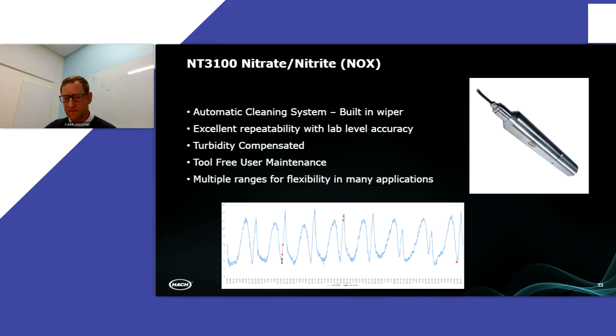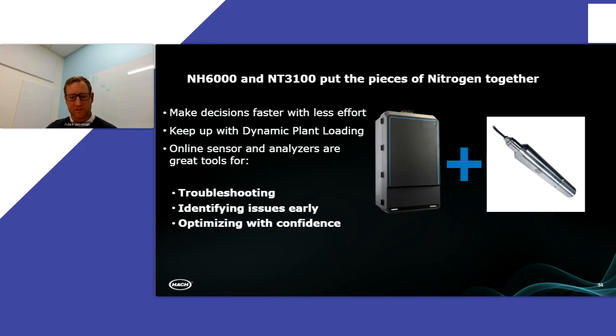So I just didn't want to leave it without throwing it together with the complete picture of total inorganic nitrogen monitoring or total nitrogen monitoring, where we're making sure we understand what's happening with both of those parameters in real time. Effluent and in an aeration basin are both. It's all a great way to help understand our process and troubleshoot.